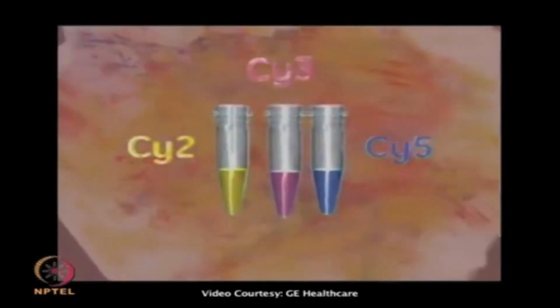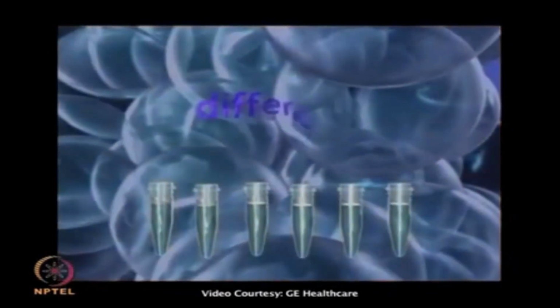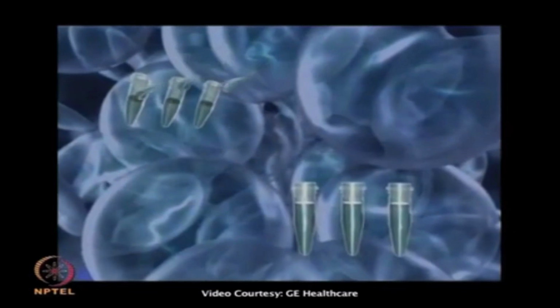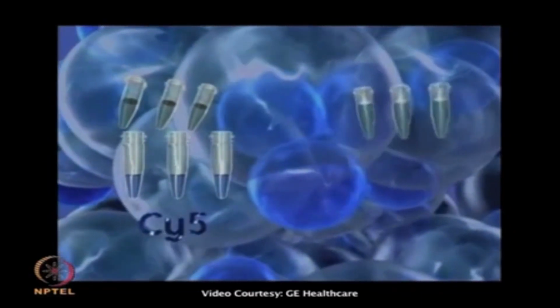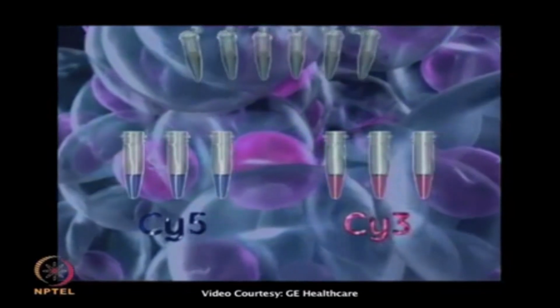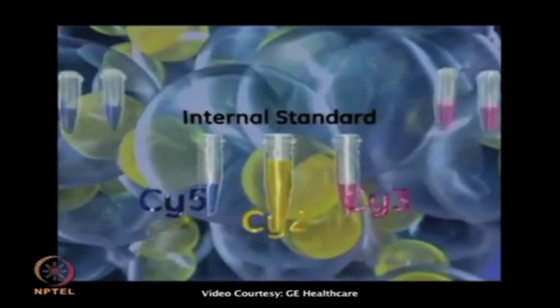Yes, as we were talking about, the 3 samples we can label with Cy2, Cy3, Cy5. Now you have 2 different samples from different sources. You take these samples into different Eppendorf tubes and label one with Cy3 dye and another with Cy5. Then you take those two samples, pool them and label with Cy2.